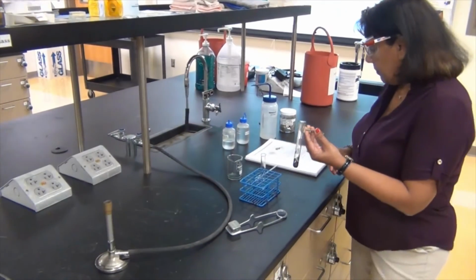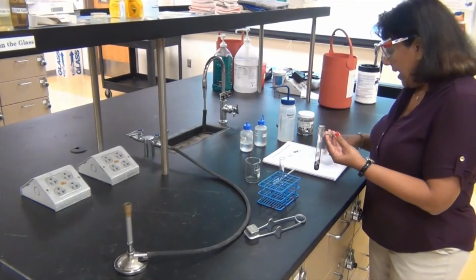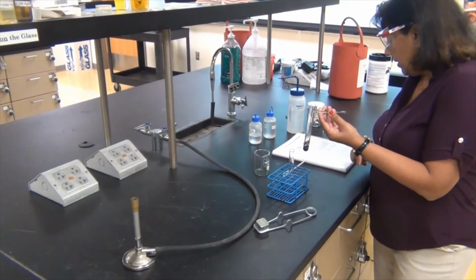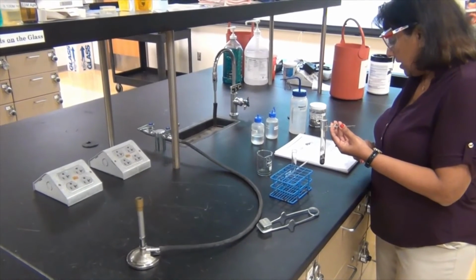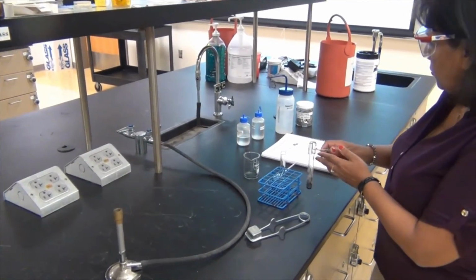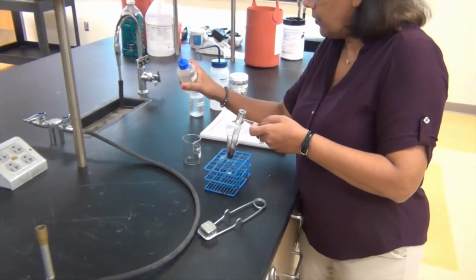So that was step number C1, where we have to heat it. And it says where the solid ejects, but you can see my technique. So good, all right. Nothing ejected out of the test tube. And now I'm going to add sulfuric acid to this, 10 drops of sulfuric acid. So let's do it this way, and here is my sulfuric acid.